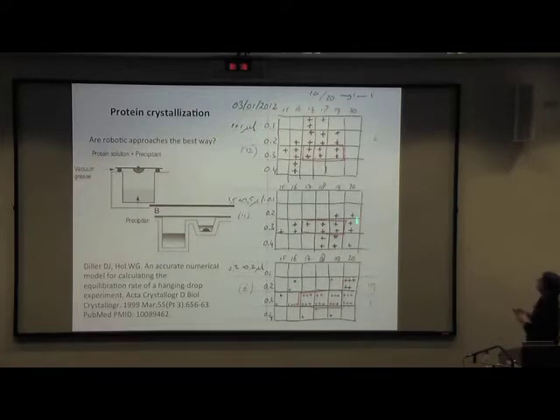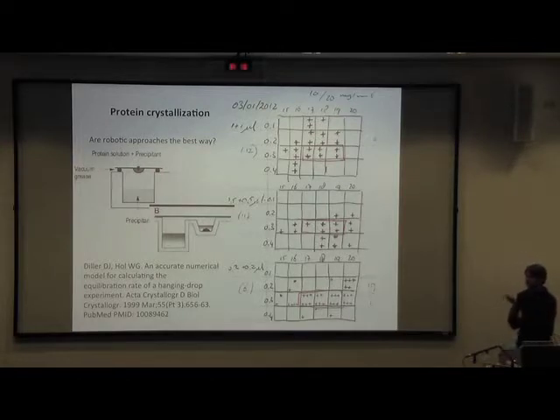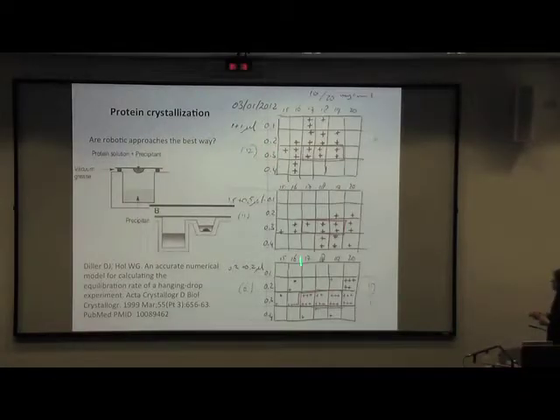Okay, so I briefly got this out of my notebook. This is an experiment I did a while ago, more than a year, a year and a half. For some reason, I wanted to crystallize a protein that I already had the structure of. When I solved that structure a while ago, I got crystals in many different conditions, and I was using a manual setup. So 1 microliter plus 1 microliter, you grease the cover slip, you bang it on. Very cumbersome, but I got many, many crystals. And when I set it up with the robotics tray, I didn't get any crystals in 400 conditions, and that puzzled me. So I went ahead and compared different conditions in which you crystallize.